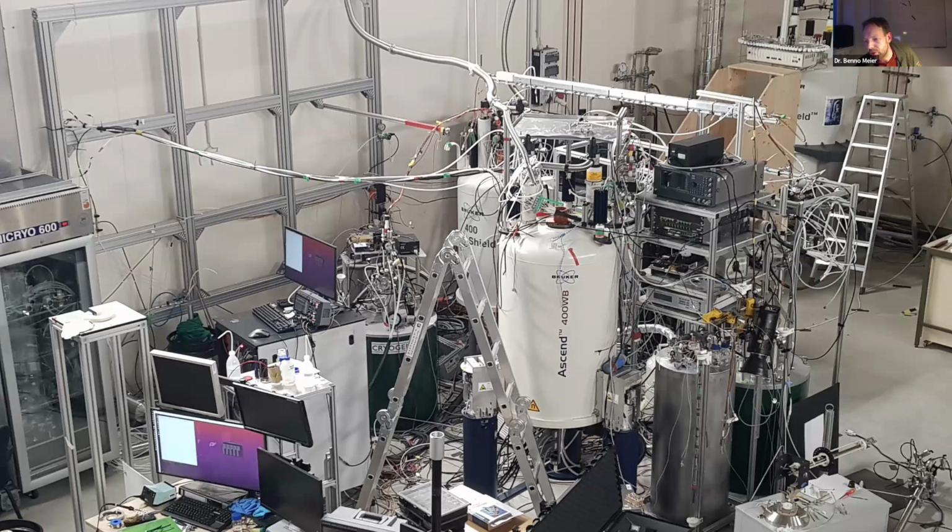And that's where our polarizer is, this green can here. Then we polarize them. And once they are polarized, we shoot them out of this green can into this white can here. This is our liquid state NMR machine. And then we record the spectrum. And then we clean the system. So we get rid of the old bullet and we get rid of all the solvents and we repeat.